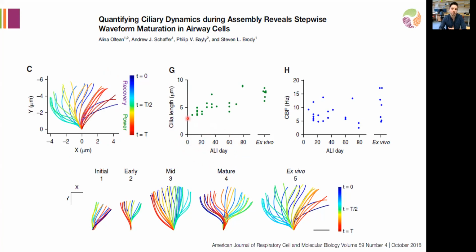We can see that in early days, in culture from 0 to 2 months, the cilia are growing and the frequency is slowly increasing. And you can see here, the same way we described the effect of length on Chlamydomonas cilia, how the waveform actually appears from something really stiff to somewhat of a normal shape. It's a really interesting paper, and then they look at where some of the inner dynein arms, proximal or distal, actually go. I don't go too far into the paper, but there is now a really good description of cilia waveform.